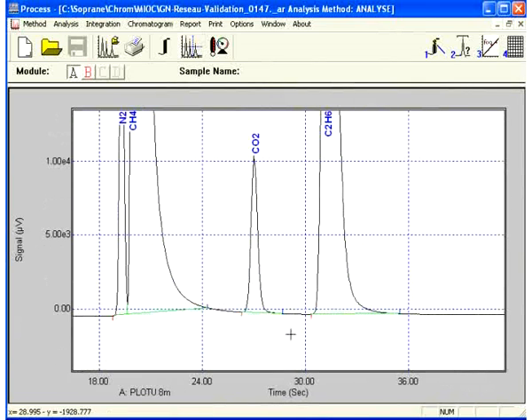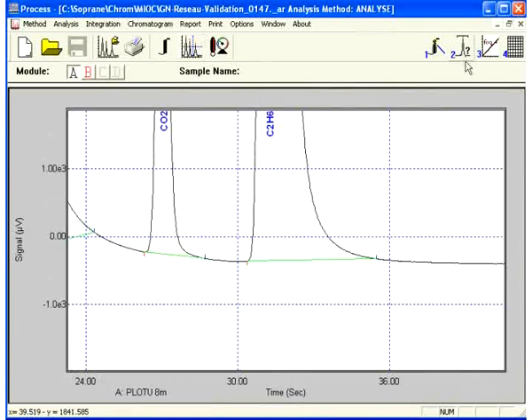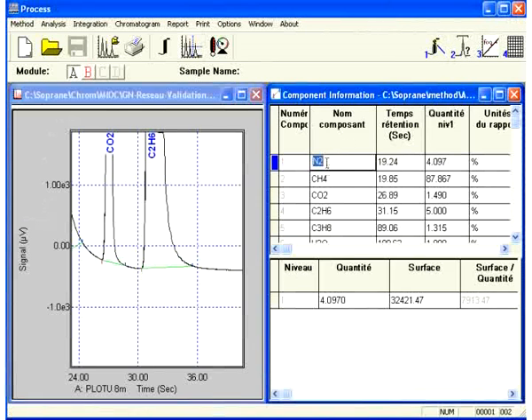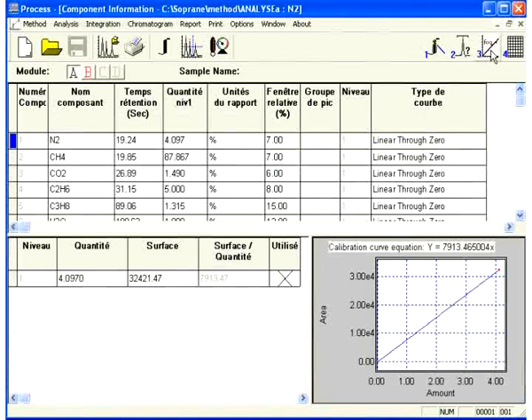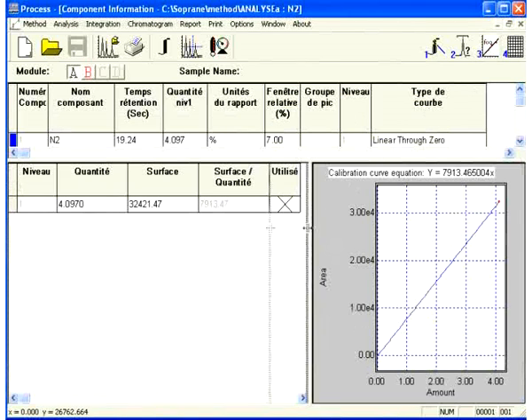In addition to general file management needs, Sopran file manager collects and groups all pertinent information concerning your micro GC configuration, your methods and the error messages emitted.